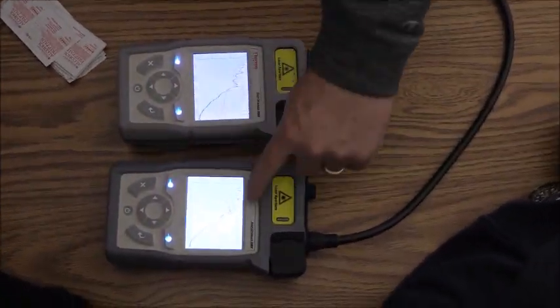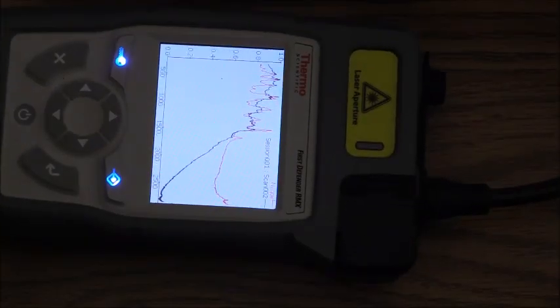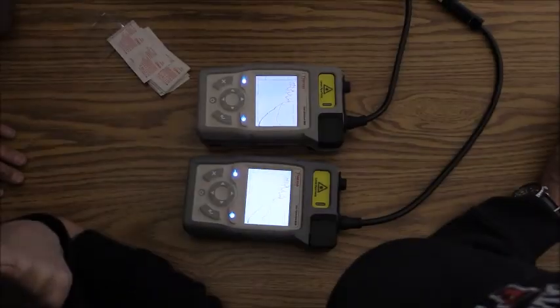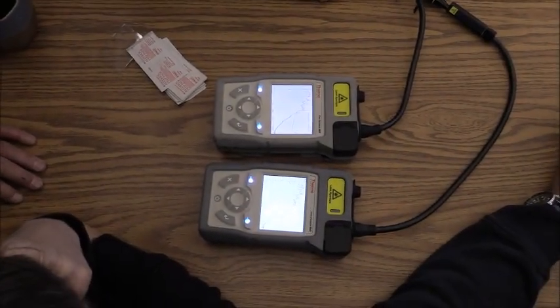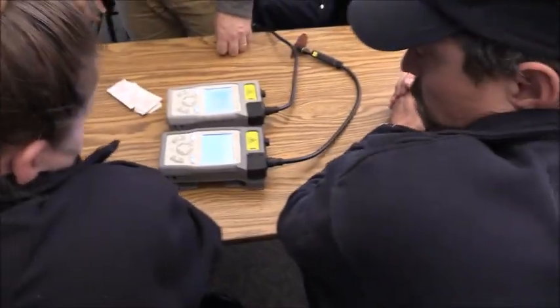Look at the spectrums. The black is your scan. And that's the known. The red is the known. Remember I said the ski slope? The ski slope was what? Interference. So does it go through the library to what most closely matches?